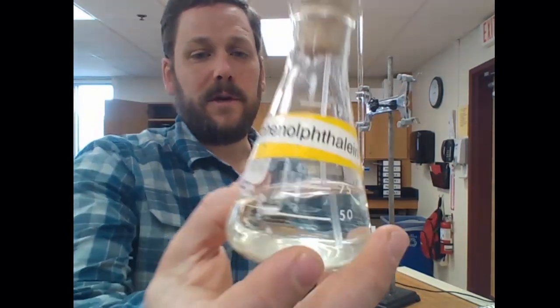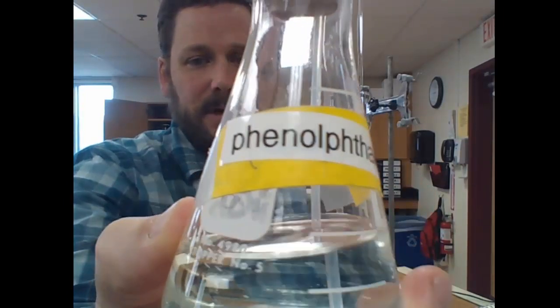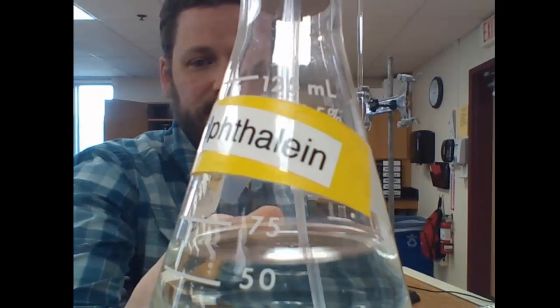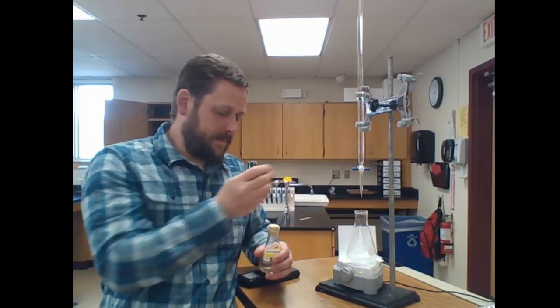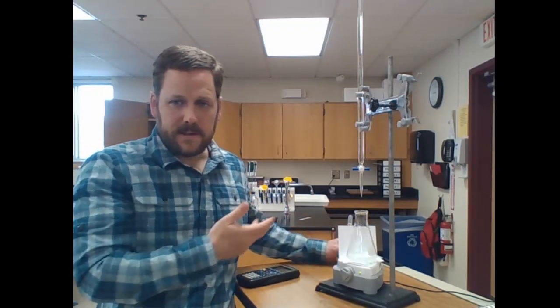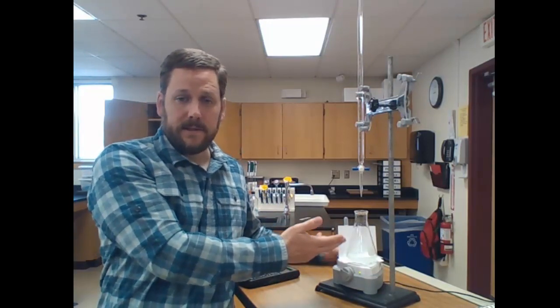The acid-base indicator we're using is called phenolphthalein, and phenolphthalein is a pretty difficult word to spell. However, it's a pretty commonly used acid-base indicator. It will turn pink in basic solution. We only need to add a little bit to our solution, and if it's basic, it'll turn a bright pink. Now you can see it's colorless right now, and that's because this analyte is acidic.